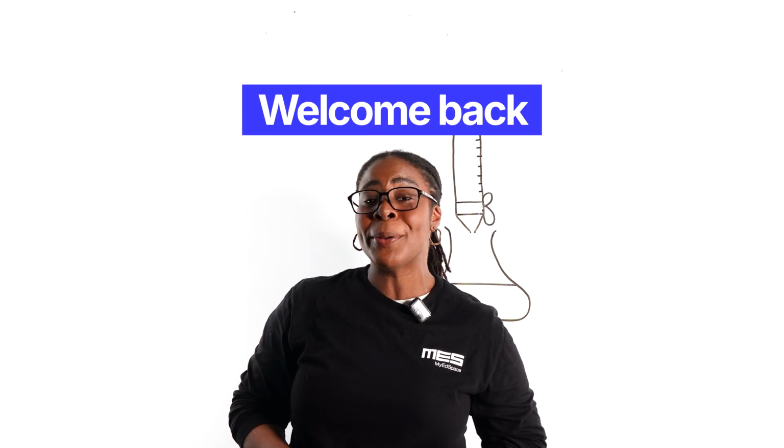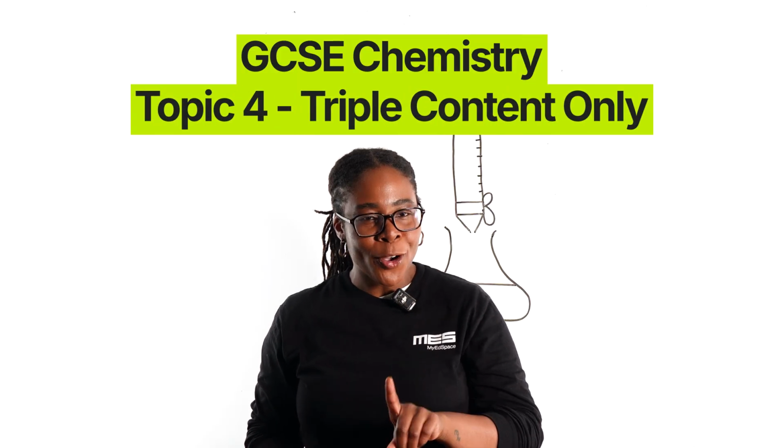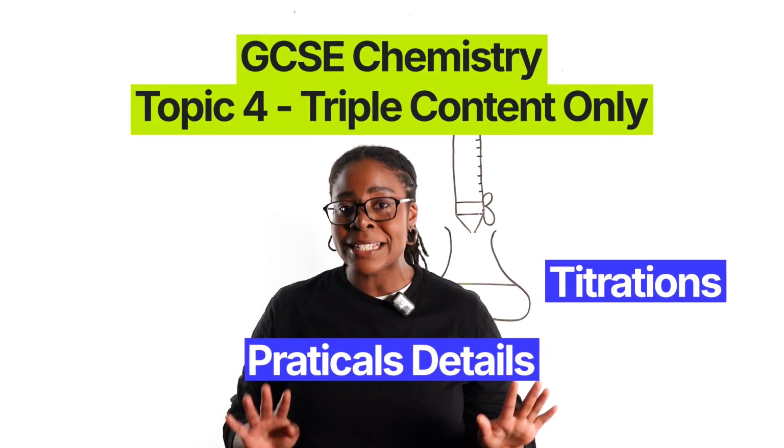In this video, I'll be covering GCSE Chemistry Topic 4, triple content only, covering titrations, the practical details, and the calculations.